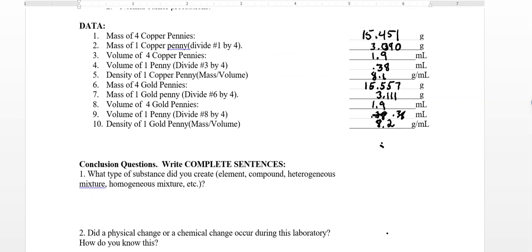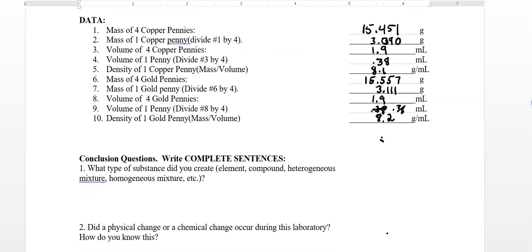This ain't gold. All right, so what happened here? Yes, it made brass. When you put it into that secret solution, you basically put it into an environment where there were a lot of zinc atoms just floating around. We created the gray powder in there. That gray powder was zinc. And the solution itself, so this gray powder down here was zinc. And the solution itself had zinc ions floating around in it.